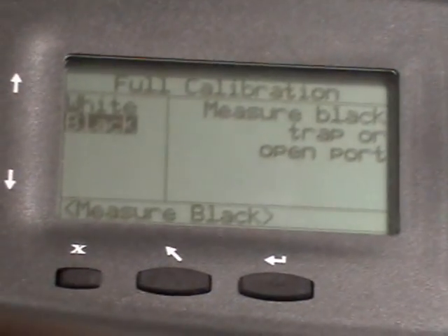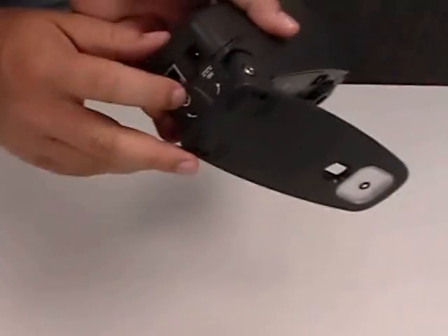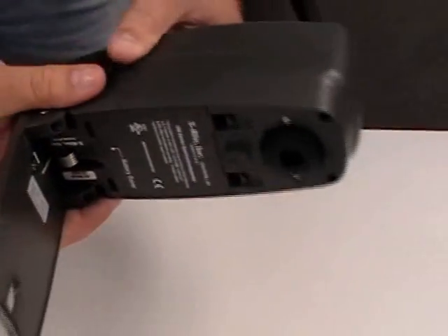Once the white is actually complete, it's going to talk about measuring black. You can actually move your white plate out of the way — you're no longer going to need that. Flipping the instrument around on the back side, if you slightly depress the bottom shoe and twist the side, allows it to open to a 90 degree angle.